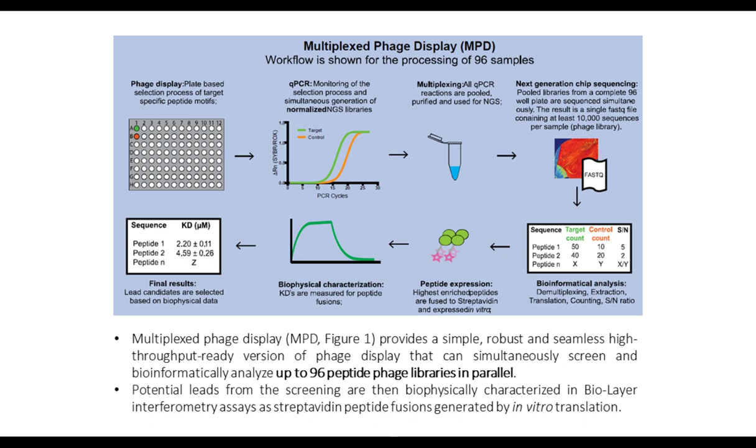And what we have found, and this is new, at least I haven't found it in the literature at the point that I was doing my PhD, is to calculate the signal-to-noise ratio, which is usually done by spot ELISAs, from also sequencing the background in this well.